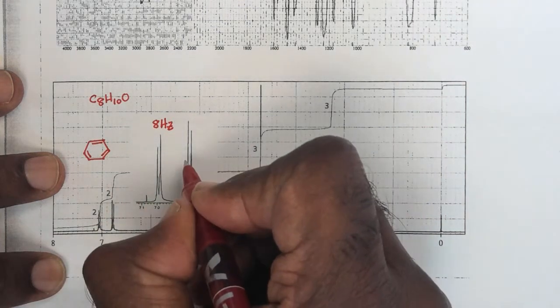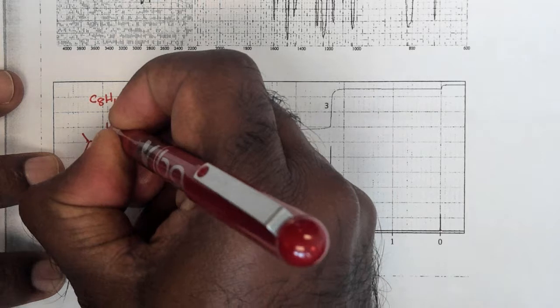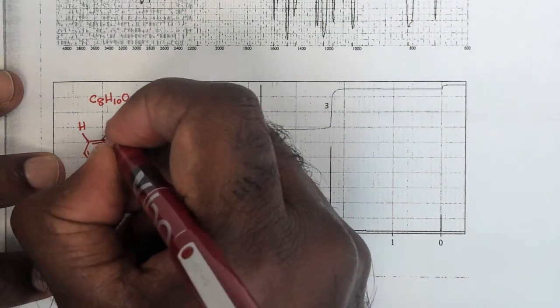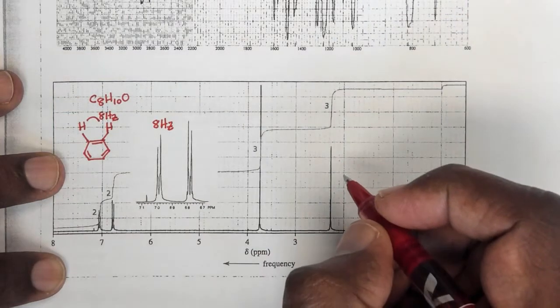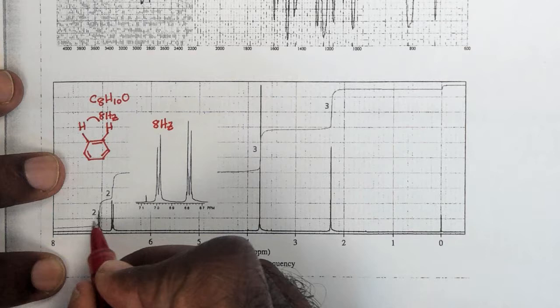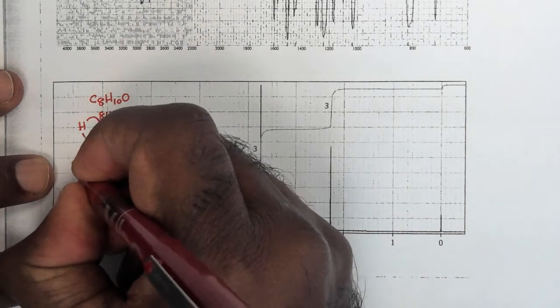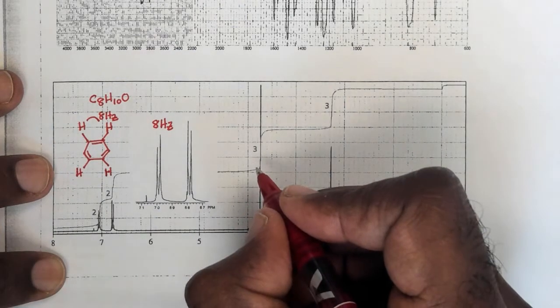So now I have two doublets, which means that I have ortho protons here. So if I have ortho protons here, this would give me a coupling constant of 8 Hertz. I have 4 protons in this spectrum, so I must have a symmetrical structure because I only have 2 peaks.